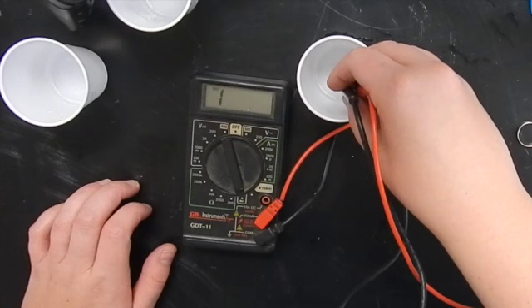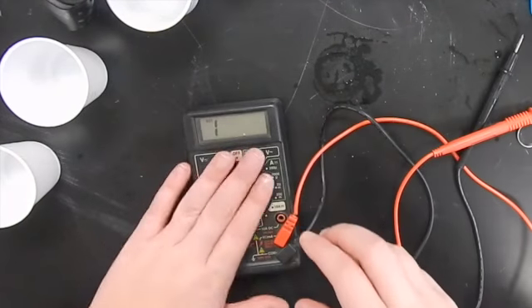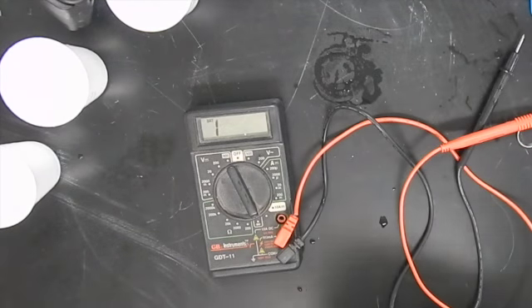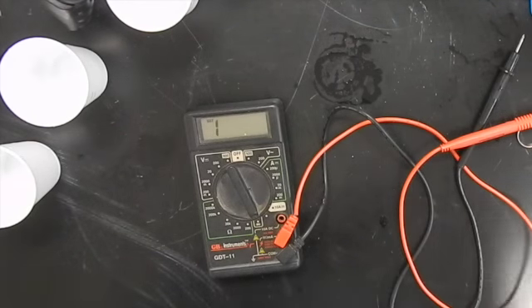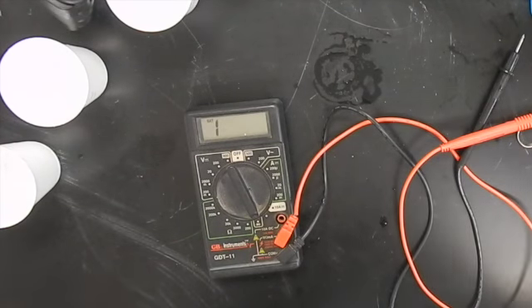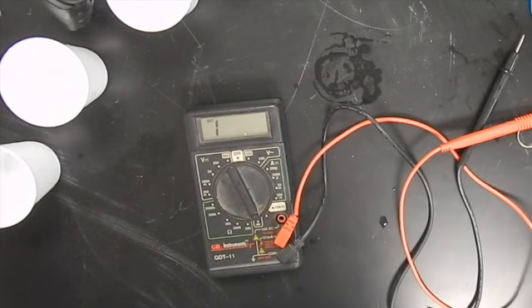So you could draw your conclusions about 1, 2, 3, and 4 based off the melting point, or how quickly they melted, and based off of what this read, if it conducted electricity. So on your digital notebook, you will need to put the relative melting point and whether it conducts electricity. And you'll need to answer the conclusion questions as well, and figure out if you think unknown 1 is ionic or covalent, and your reasoning as to why, or if it is uncertain if it is ionic or covalent.